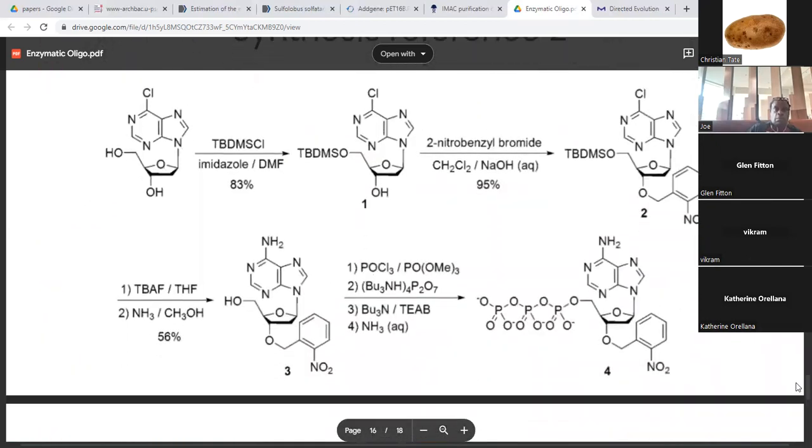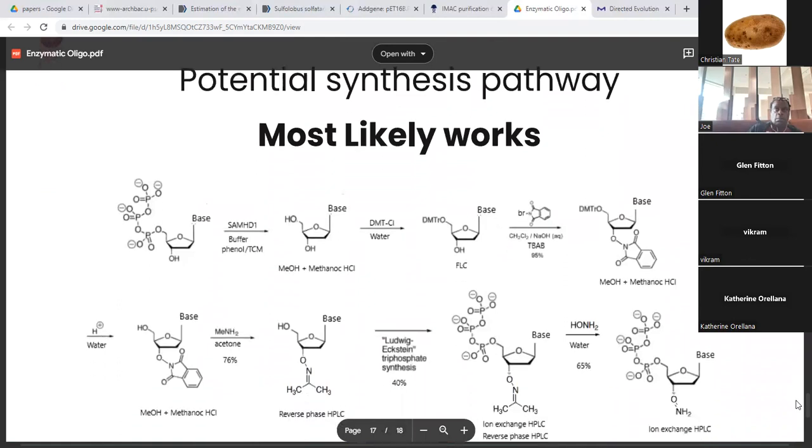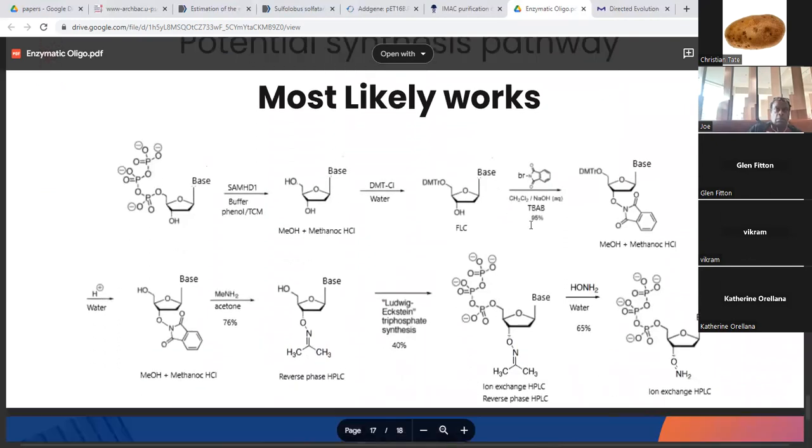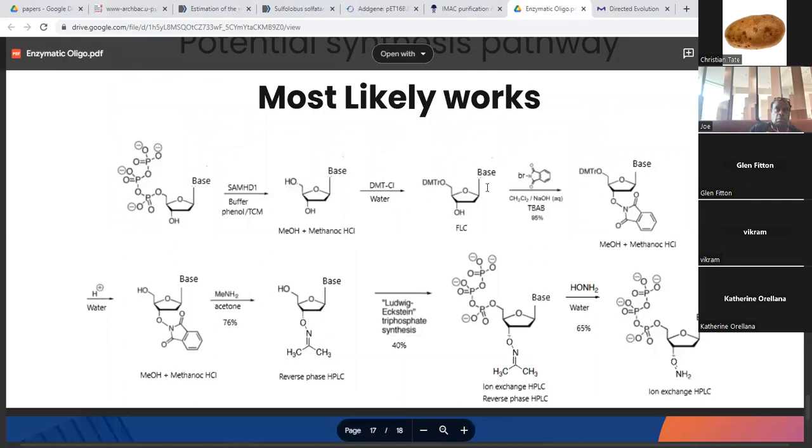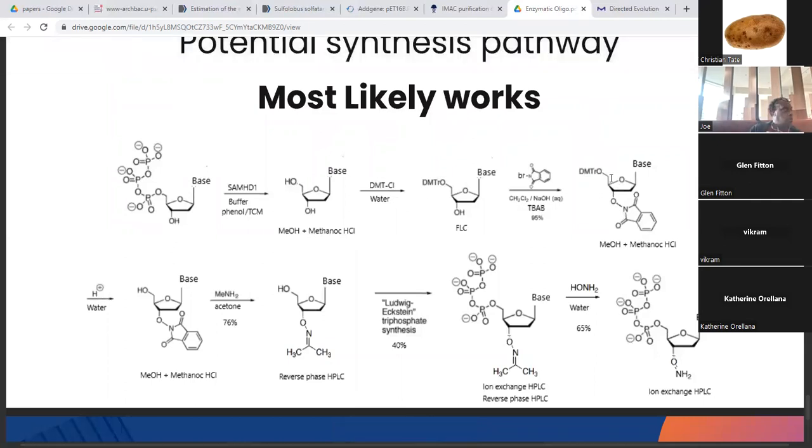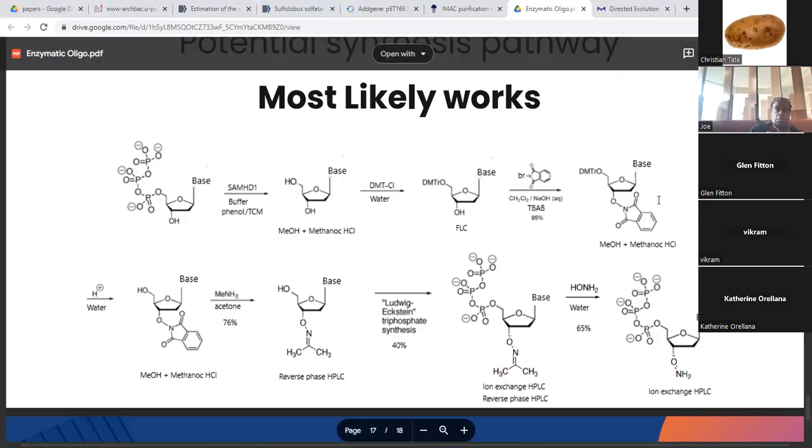And then after we got to this, I consulted with a couple of chemists, and they said that if we switch from the first pathway to a brominated version, and we keep the TBAB as the environment, we could probably switch on this intermediate from the first synthesis pathway, and then be able to do the methylamine reduction, and the, I can't think of what that's called off the top of my head, reduction, in order to get to the product that we actually want, this amino oxy group right there.